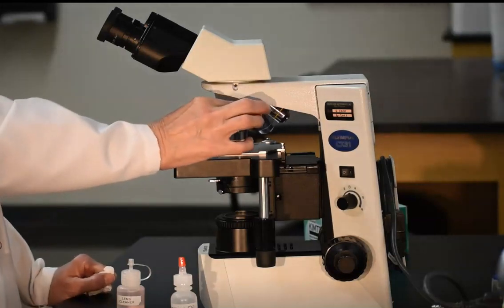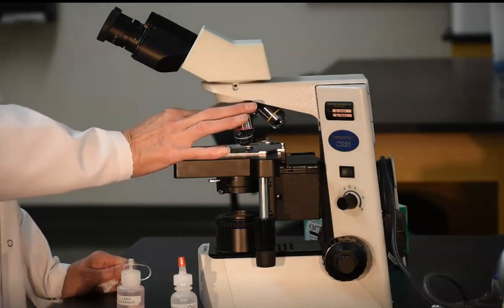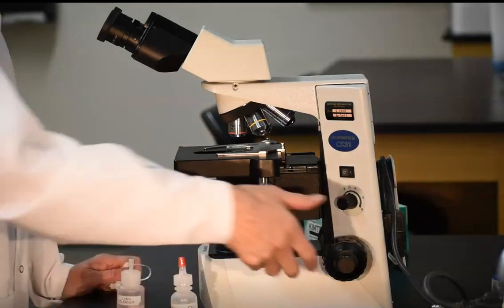When finished viewing your slide, rotate the nose piece in the direction so the scanning lens moves into position. Lower the stage all the way down and remove the slide.